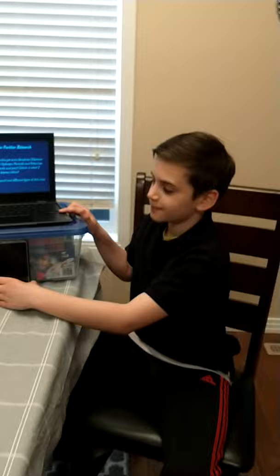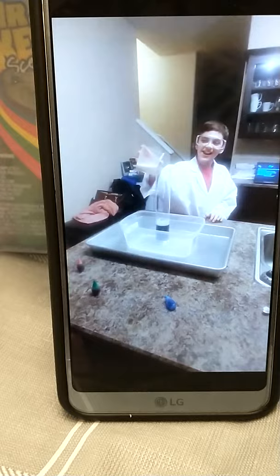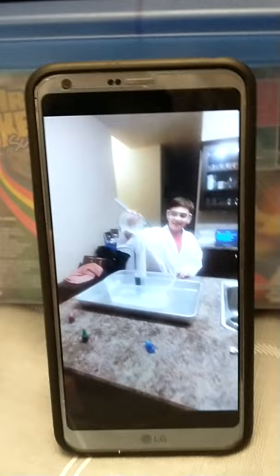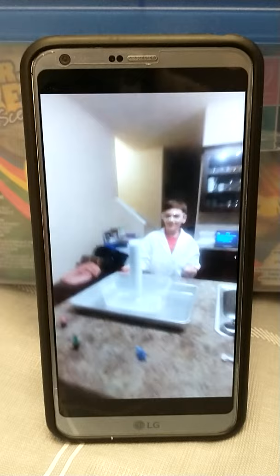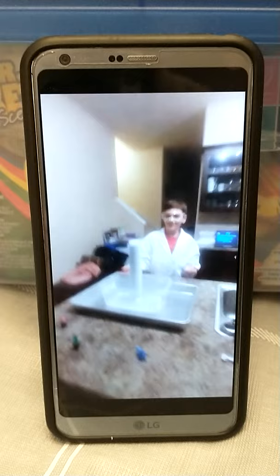Here's a video of me doing it. As you can see, I'm pouring the yeast into the flask and it's rising pretty quickly. The foam is coming out.